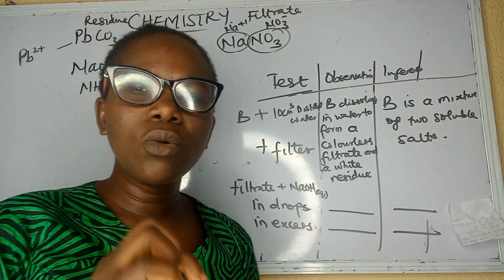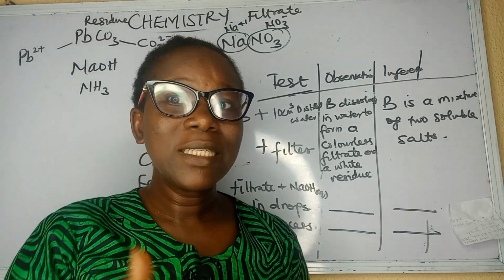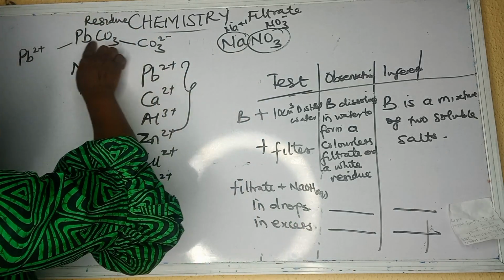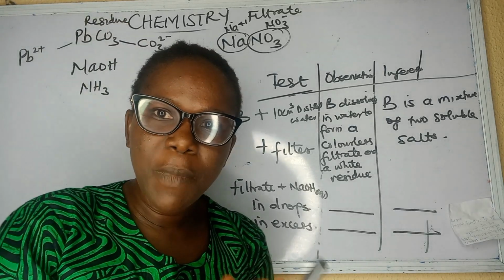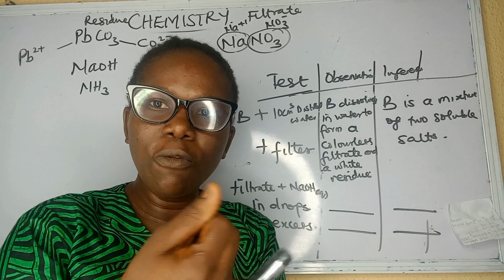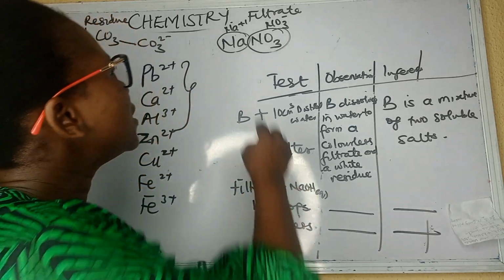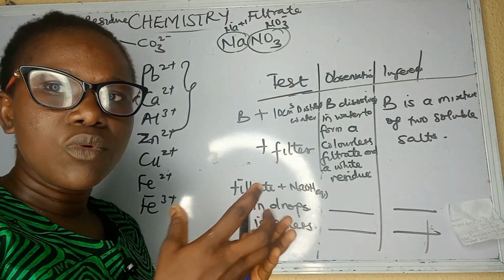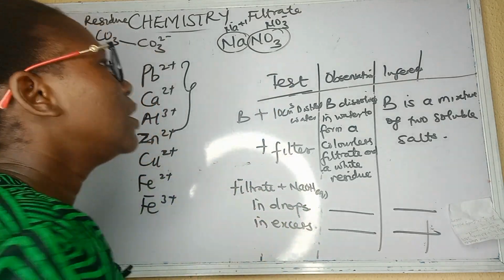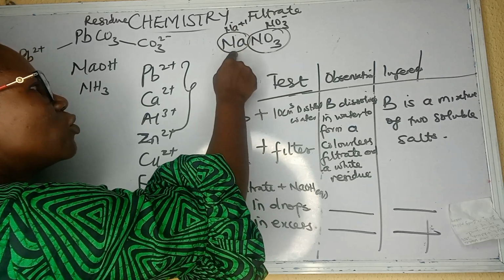So when you add sodium hydroxide in drops, what you're expected to write is this, if you are working with the residue, for instance. This is a sample of the residue, what is inside the filter paper. After you filter, you fold your filter paper and then you filter. The filtrate comes out as a clear liquid because this compound is soluble. It's like a clear liquid, just like water. Then we have sodium and trioxonitrate(V) ions inside it, where sodium is silent.